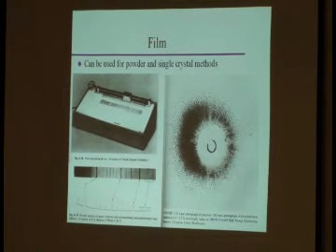One of the worst things is if people overexpose an image plate. It does have 6 orders of magnitude, but if you put a direct beam at a synchrotron on an image plate, that part of the image plate is going to be dead, okay? You can never erase that again. So yes, they will go bad, but if you treat them properly, they last a long time.